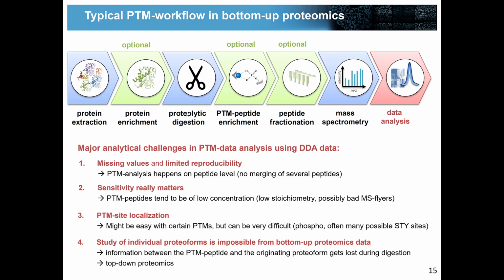Because the moment we do bottom-up proteomics and we digest, we do not know where certain PTMs were sitting on different proteoforms. But if we really want to unravel a PTM code, and if we want to know how PTMs are occurring on different positions of a protein, then we would need to stop digesting our proteins and start doing top-down proteomics to really measure complete proteoforms. And that's, as we all know, very, very challenging.